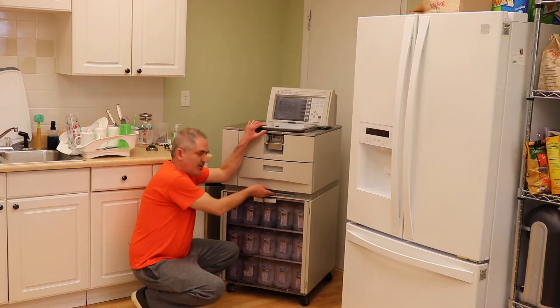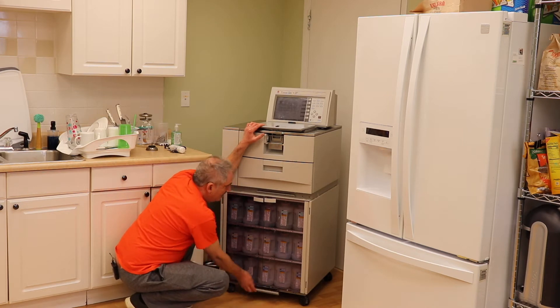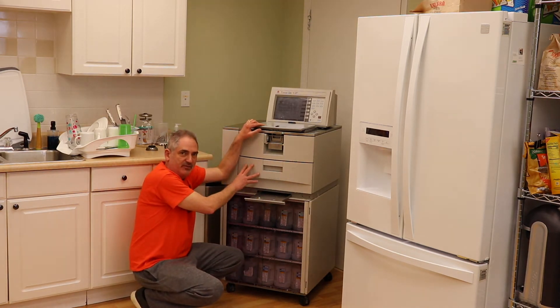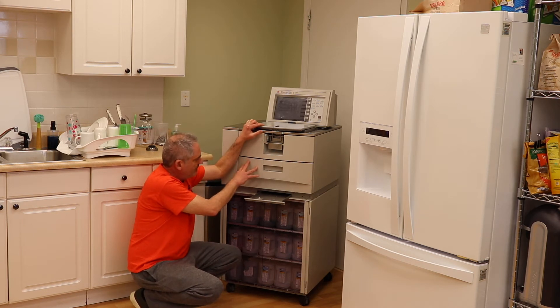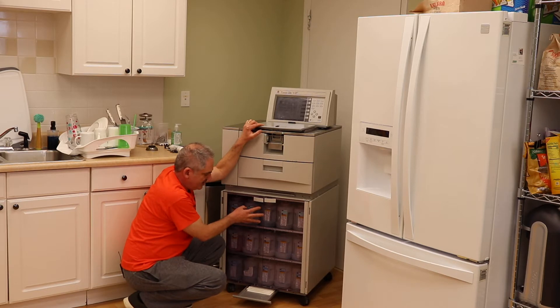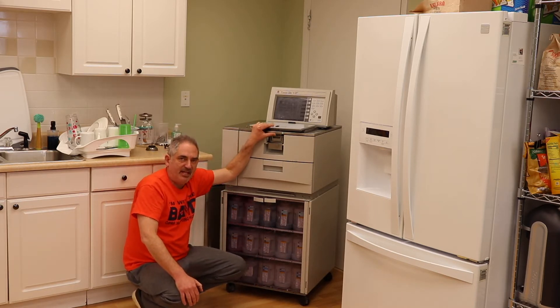There is a drip tray right here and a second one right here. This first one is designed to catch any wax that sloshes out of your oven tanks, and this one is designed to catch any liquid that sloshes out of your bottles. A lot of people ignore them and they end up filling up and making a big mess.